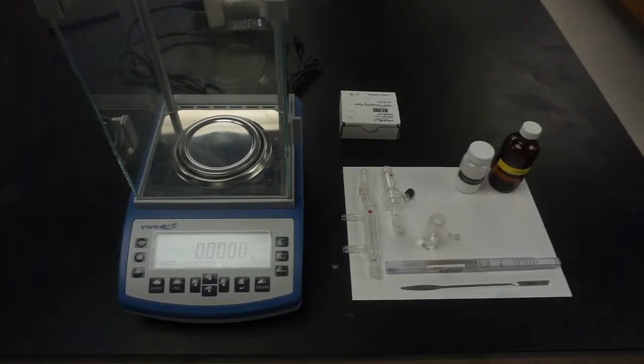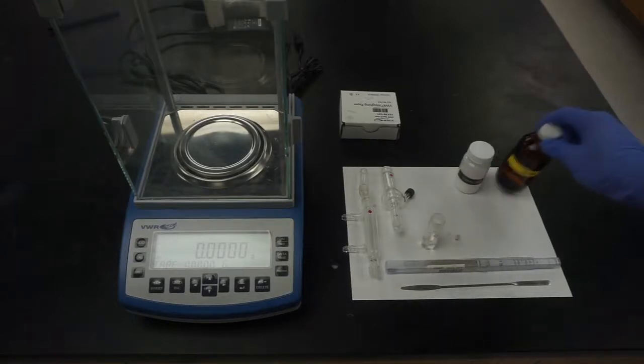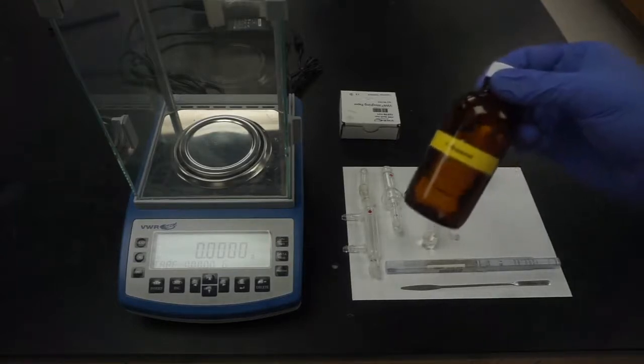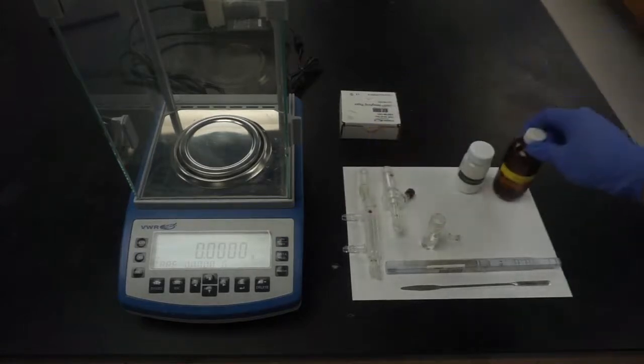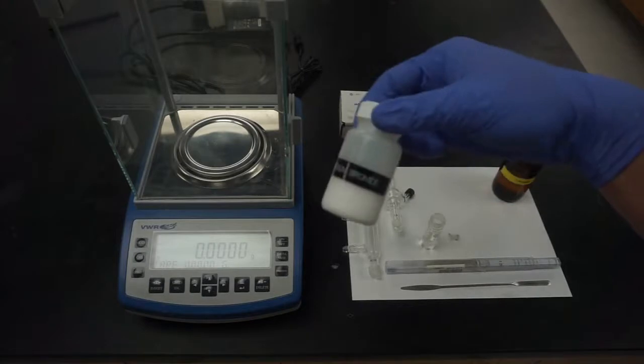First, start with the preparation of all necessary equipments and reagents. We're going to synthesize N-butyl bromide with 1-butanol and sodium bromide.